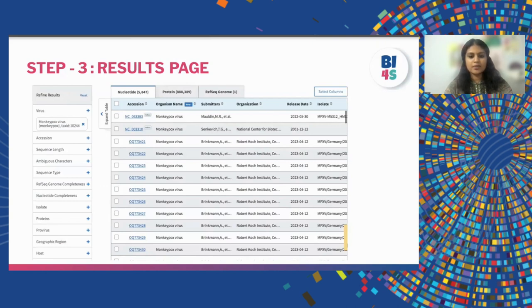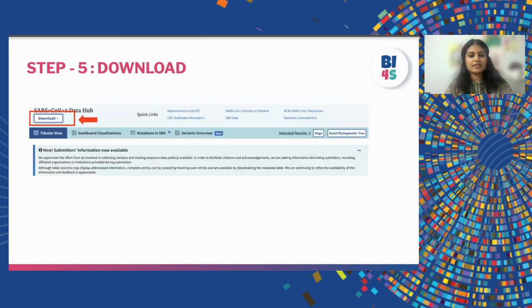Once we do that, we reach our results page. In the results page, as you can see here, there is a table column which lists all the sequences that are available, and in that we can choose any one of our sequences. The next step is to note all the details — the accession number, the length, and if we navigate to the right, we can see the length as well as the host name of the virus. We are going to note all of that.